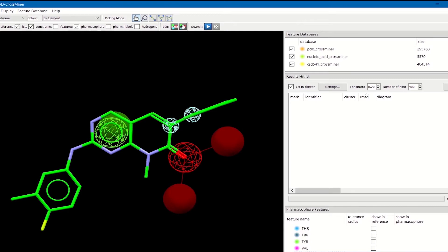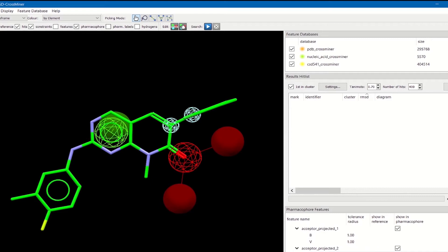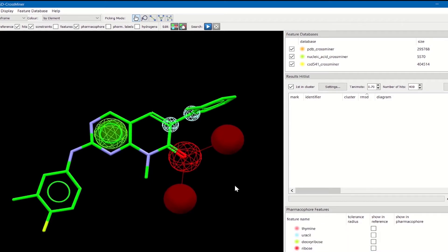In this window you also have information about the pharmacophore, for example the pharmacophore query that is generated and what kind of pharmacophore points are generated. This pharmacophore query is composed by a ring planner projected, an acceptor projected, and an exit vector. We can further customize this query by adding intramolecular constraints, retrieving hits where all these pharmacophore points belong to the same molecule.